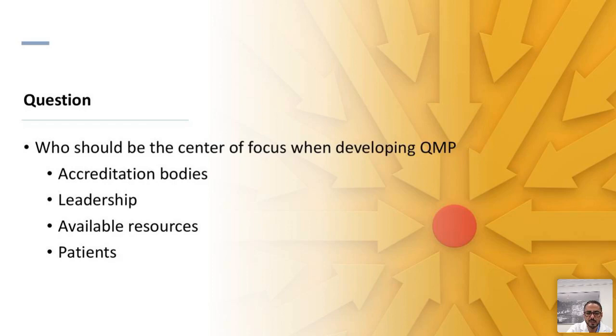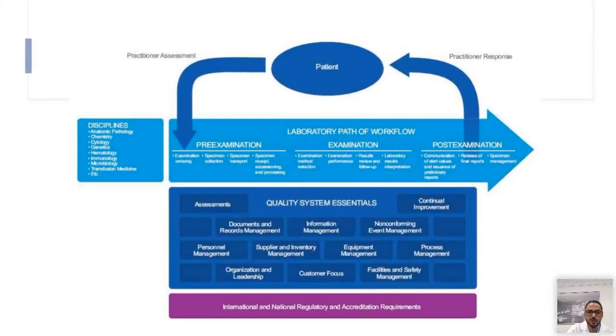So looking at this new slide from the updated version of the quality management system by CLSI, as you can see in this diagram, the foundation of the quality management system is the regulatory and accreditation requirements.